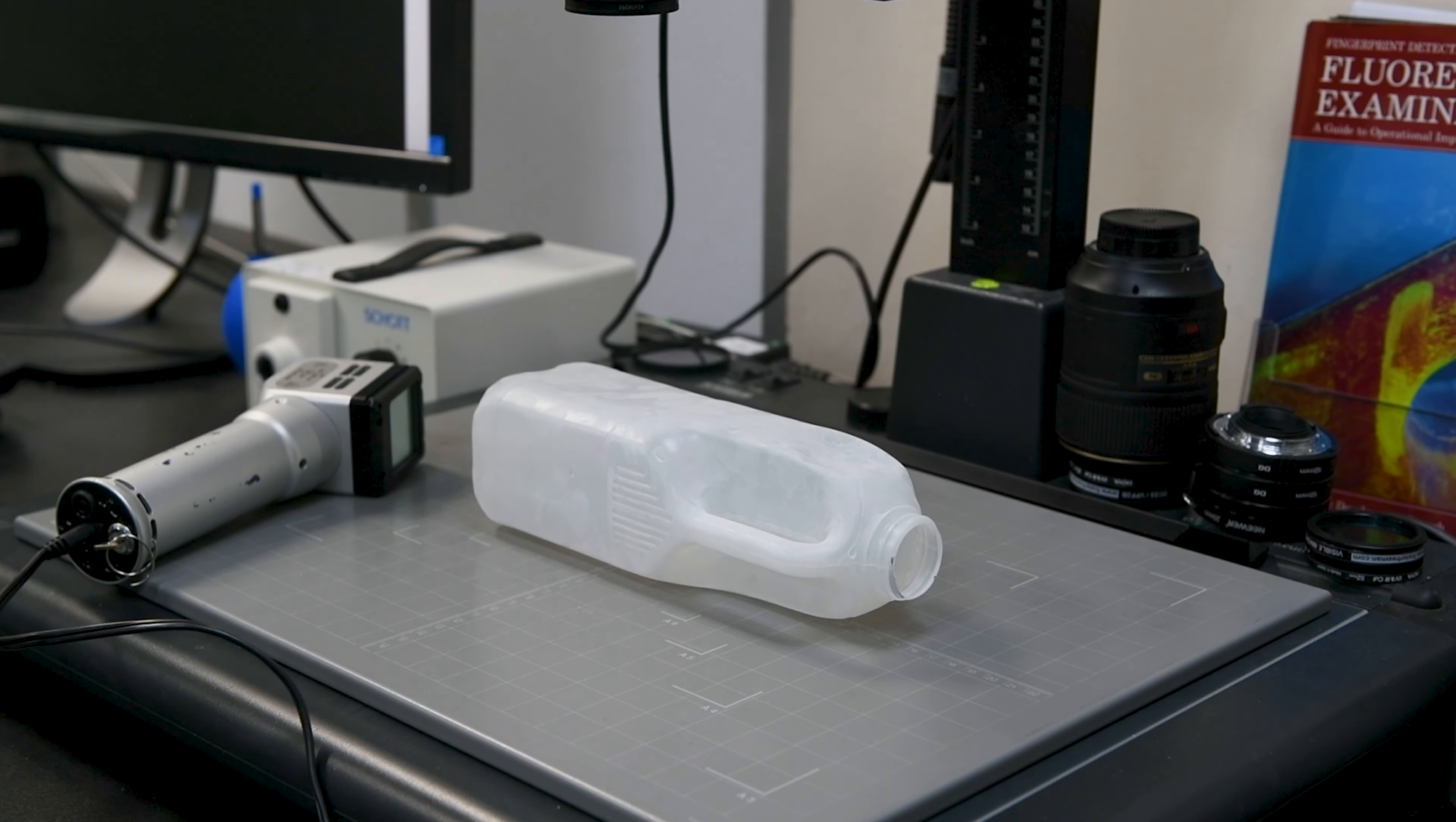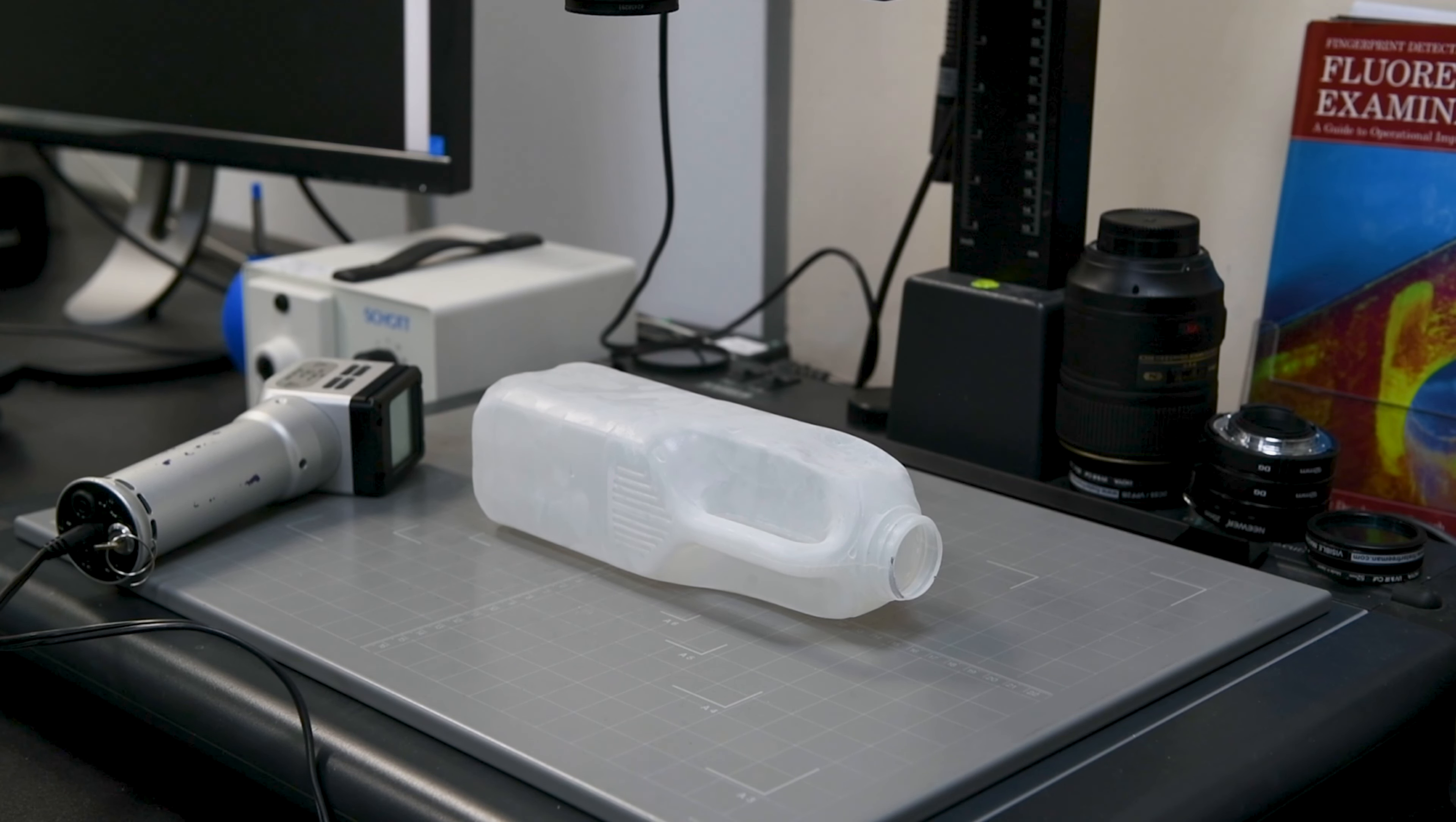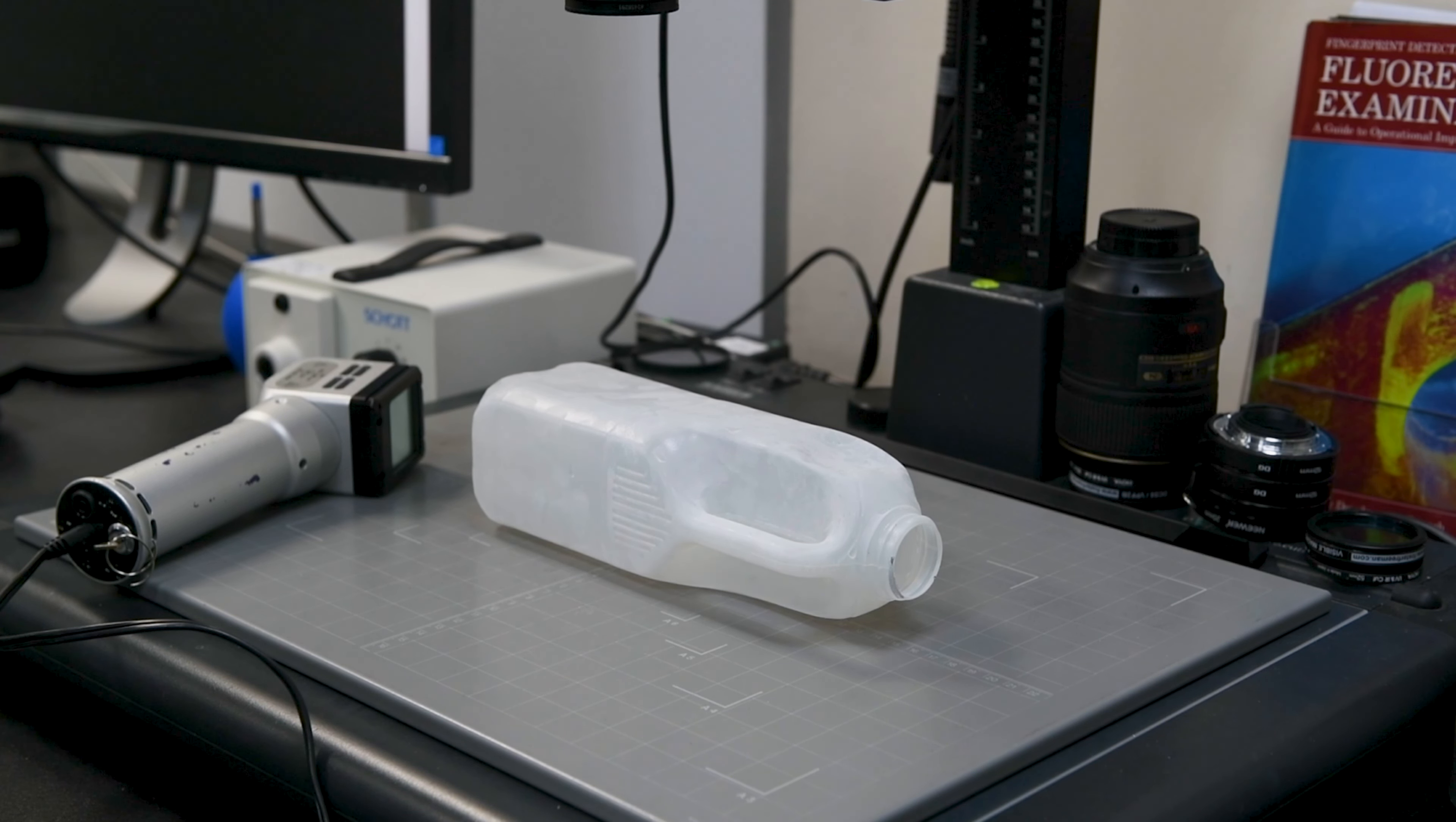Because of how the polymer develops on the surface, it really readily scatters UV light and it can create fantastic contrast between the fingerprint and the background.